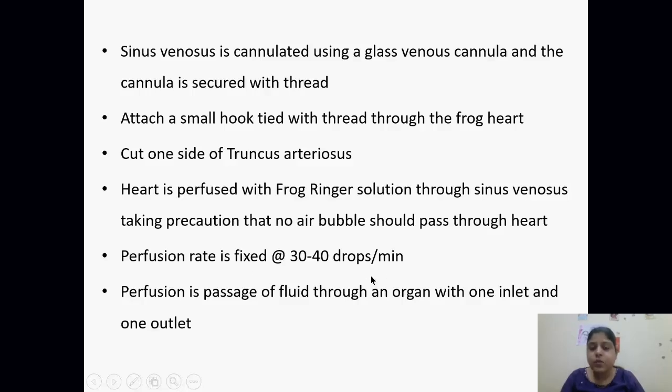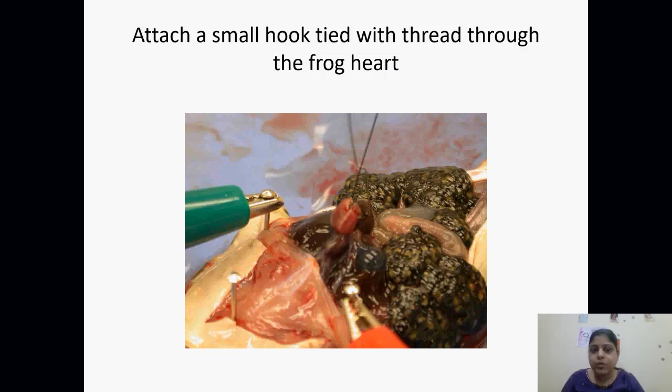Perfusion rate is 30 to 40 drops per minute. Perfusion is the passage of fluid through an organ with one inlet and one outlet, as you already know.